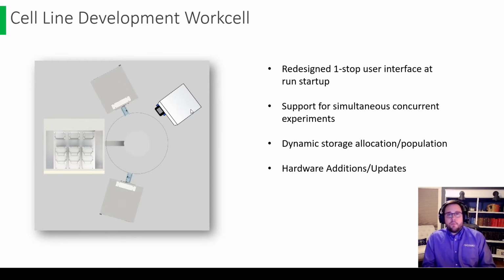Now, that meant if you wanted to image 3 plates and the batch size was fixed at 10 plates, you had to waste all this time running your initial 3 plates, then imaging 7 blank plates, and wasting all that space on your hard drive, all the time in the lab, and just making sure everything else was up and running. So that was the first thing we fixed.